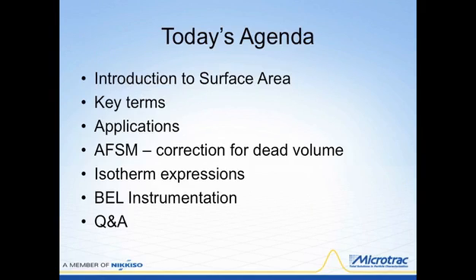Now I would like to introduce you to today's agenda. First, we're going to introduce you to surface area. For some of you, this may be a refresher. For others, this will be a great learning opportunity. Key terms such as the difference between chemisorption and adsorption, applications such as zeolite, ethanol separation. We will also take a deeper look into our patented approach to improving measurement efficiency by correcting dead volume. This approach is called AFSM.